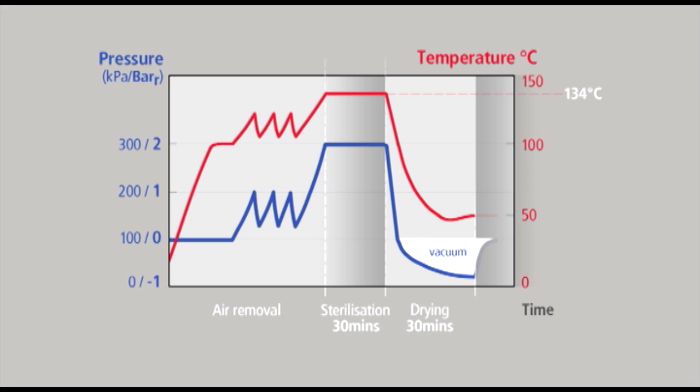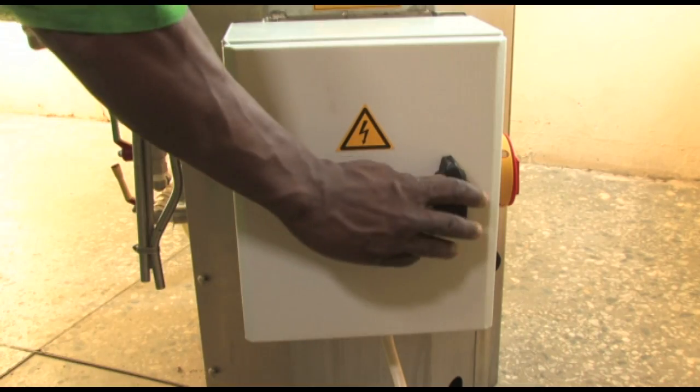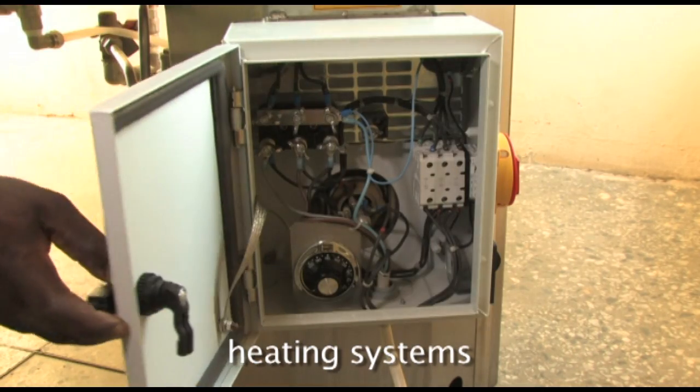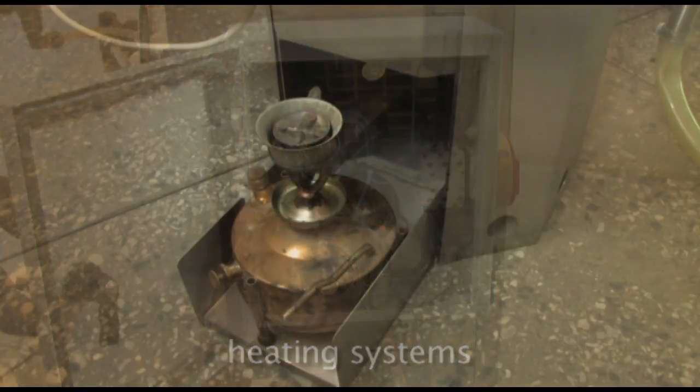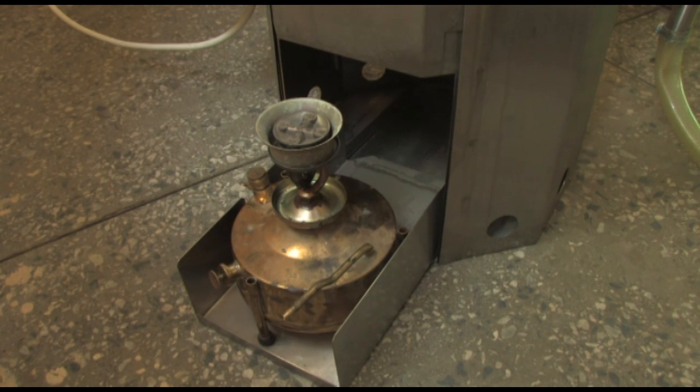Finally, filtered air is allowed back into the autoclave so that the door can be opened and the load taken out. The autoclave can be heated by electricity or kerosene. Heating by gas is also possible.